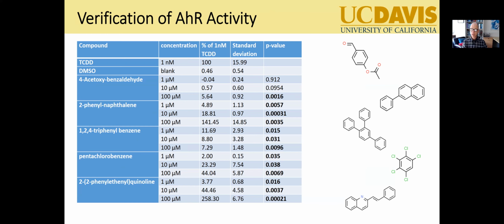We used statistical procedures to fish things out, and as you see, we had a very high fraction of those compounds subsequently proven to be active on the receptor assay that we fished them out with. And so this suggests that we can indeed do what we're trying to do, which is test whole samples, use statistical procedures, find the unknown compounds, and identify them and confirm their presence in the samples, even when we have no prior information about the compound's biological activity in question.